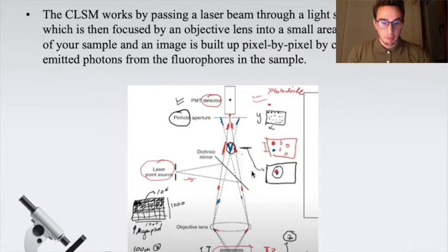If we have a camera in this place, we have an image like this with different depths in the sample. Assume that the red particle is a cell, and the blue one is a different cell, but they have different depth scales, but we see it on the camera like this picture.